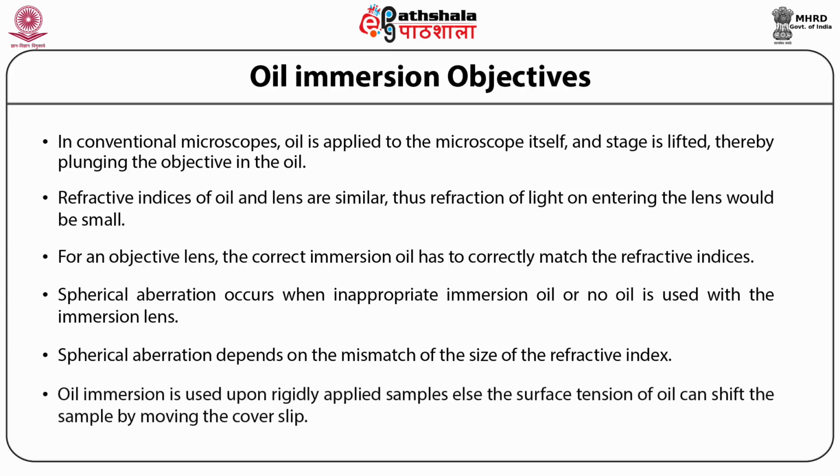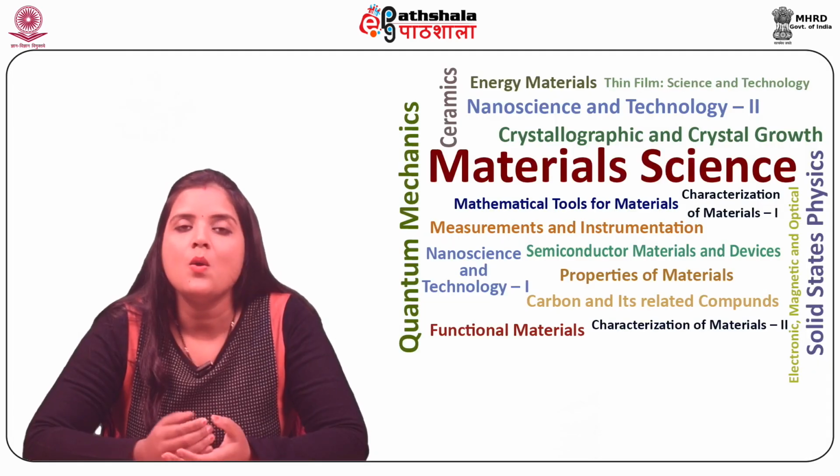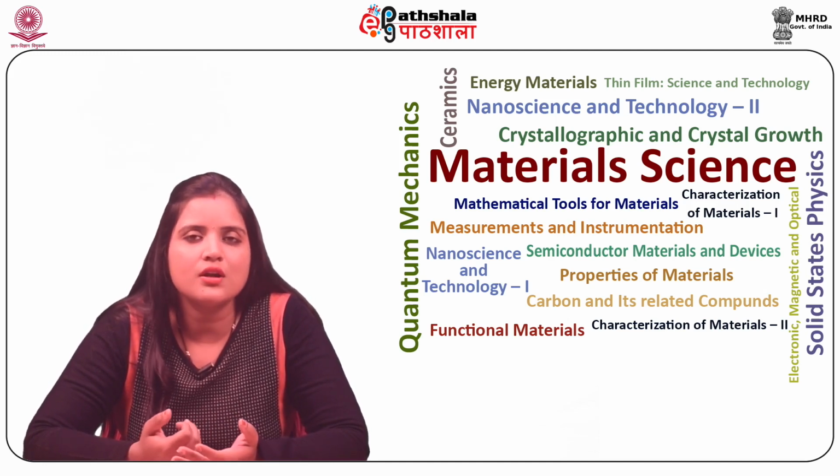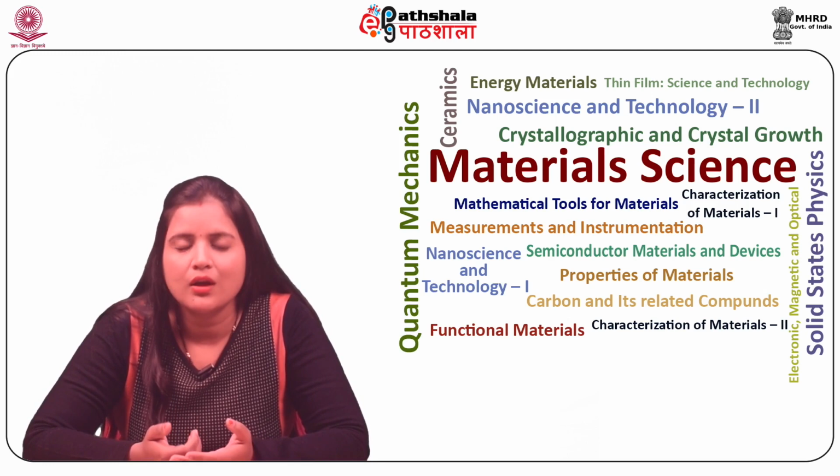Oil immersion is used upon rigidly applied samples, else the surface tension of the oil can shift the sample by moving the cover slip. This can also occur in inverted microscopes as the cover slip is under the slide. We will now study the advantages of oil immersion microscopy.